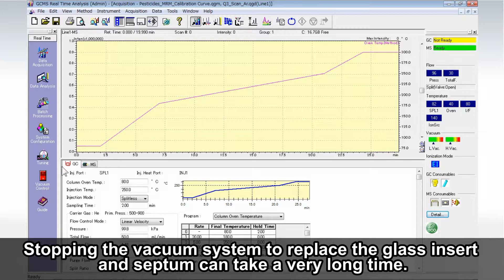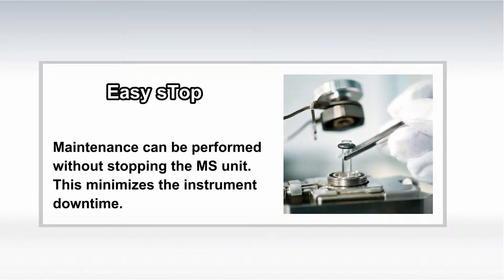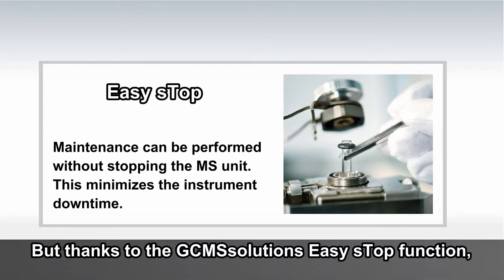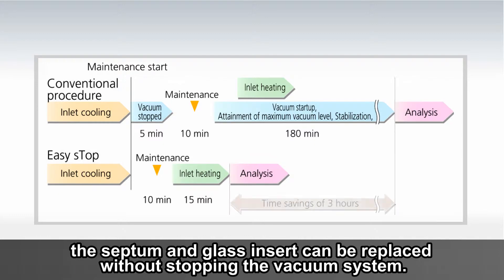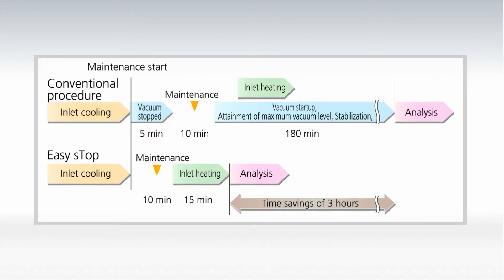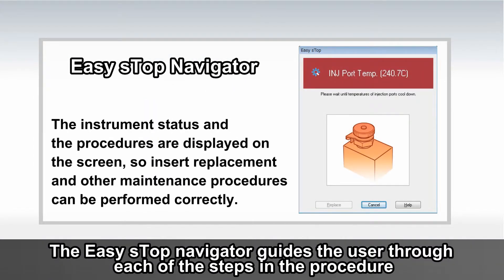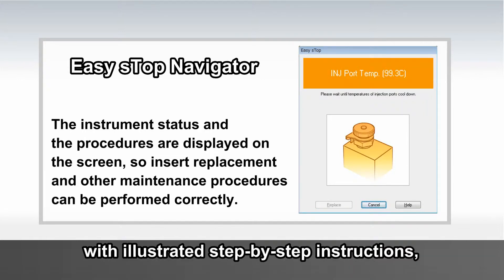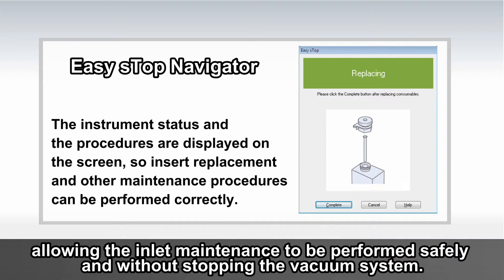Stopping the vacuum system to replace the glass insert and septum can take a very long time. But thanks to the GC-MS solutions EasyStop function, the septum and glass insert can be replaced without stopping the vacuum system. The EasyStop navigator guides the user through each of the steps in the procedure with illustrated step-by-step instructions, allowing the inlet maintenance to be performed safely and without stopping the vacuum system.